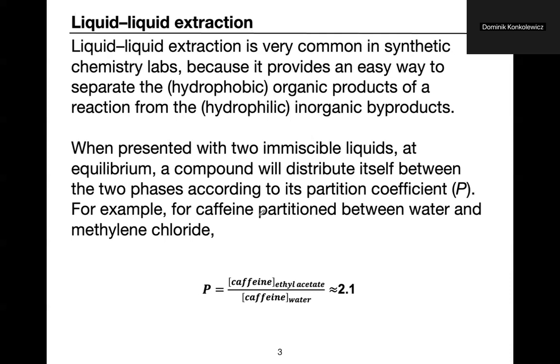For instance, it's used very commonly because it's a relatively simple way of separating compounds that are more hydrophobic or don't like water very much from compounds such as inorganics or molecules with lots of hydrogen bonding groups on them, which are much more soluble in water, right? So the hydrophobic things will prefer to go to the organic phase, right? So typically organic products will prefer to go to the organic phase, and inorganic or highly polar compounds will tend to go to the aqueous phase, right?